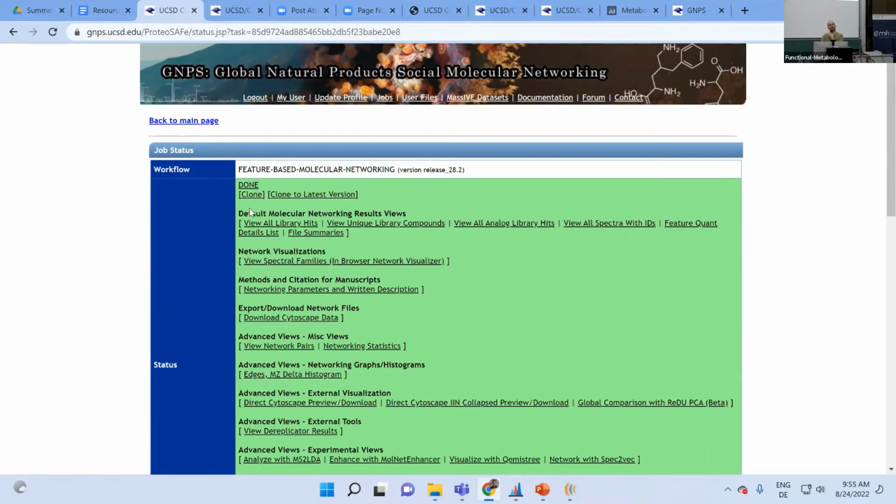You mean redo? Oh, review, yeah. Before you report this in the main text of your manuscript, I would strongly suggest you to do that.